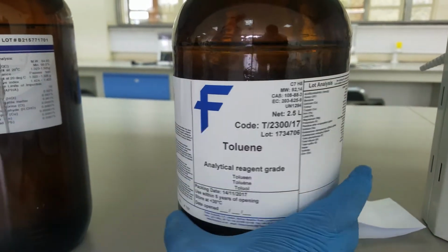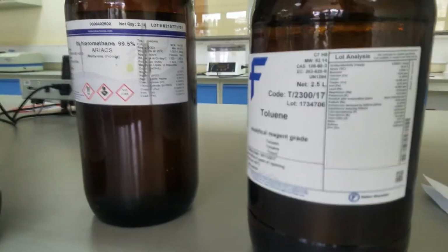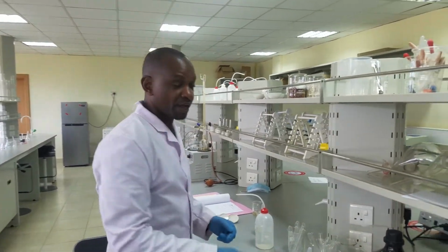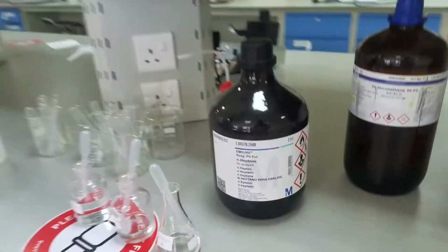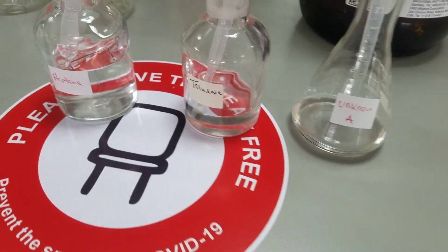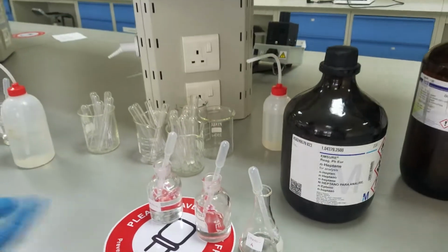Toluene, as the name suggests, is an aromatic. It has a benzene ring, circular in nature. Then we have also given you one unknown, and at the end of the experiment, you should be able to tell us what unknown A is, so that you can identify the 2.